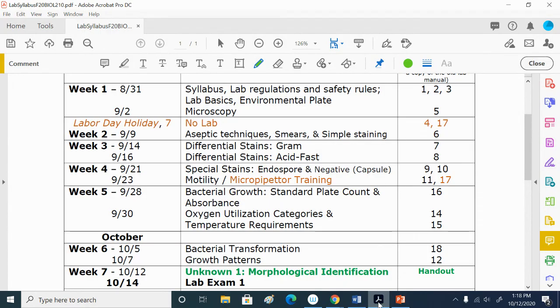And so what should your smear look like when it's dry? You should barely be able to see it with your eyes. Should it be thick? Right, very, very slightly cloudy. You should be able to see something, but not easily. You don't want it thick, you don't want it dark, you don't want it clumpy, right? So a nice thin, even smear.